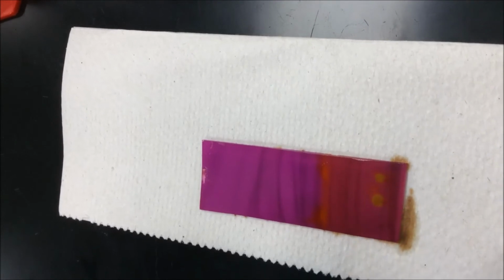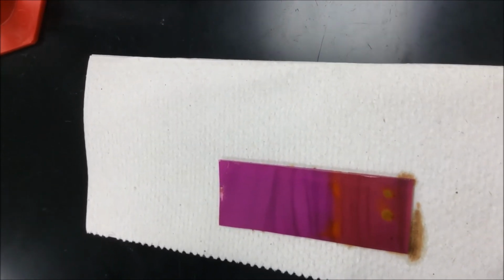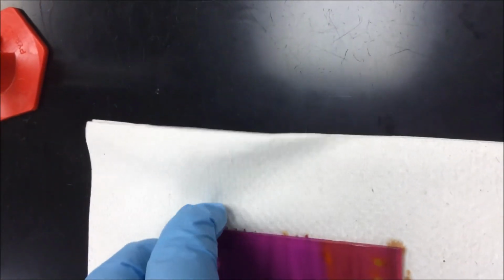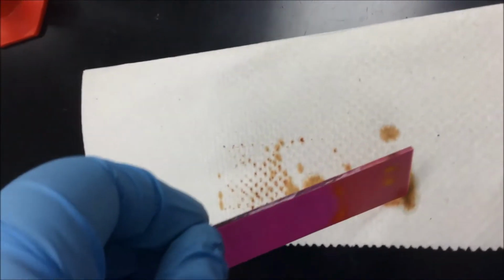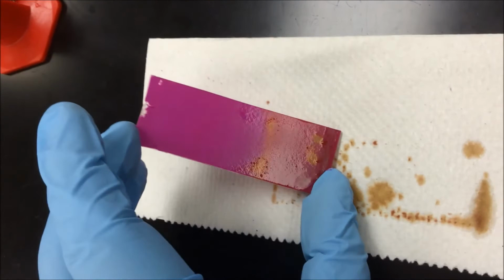So that is a good sign, because in this TLC that tells me there was no cross-contamination that was ongoing in this particular case. So I can use the results from this TLC in order to carry out my column chromatography.